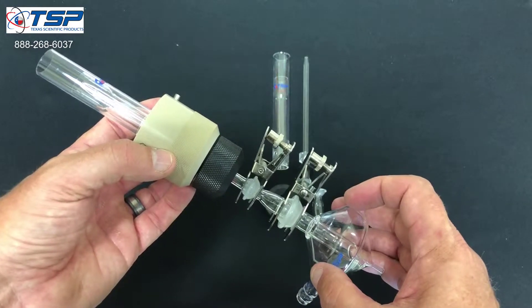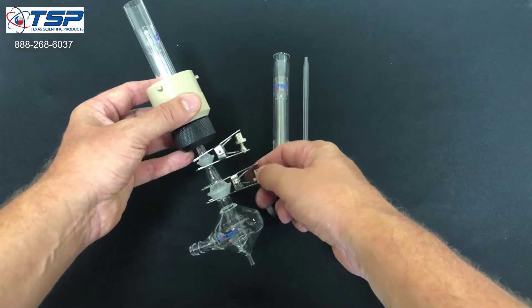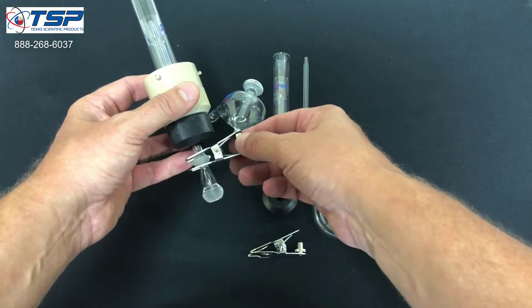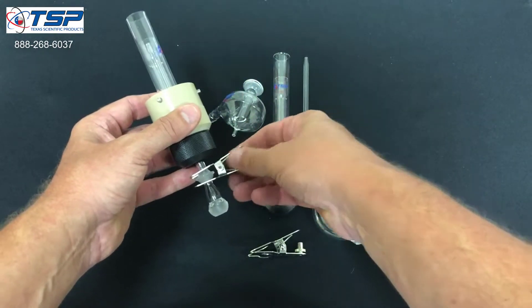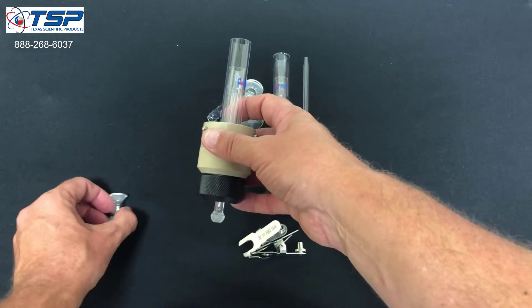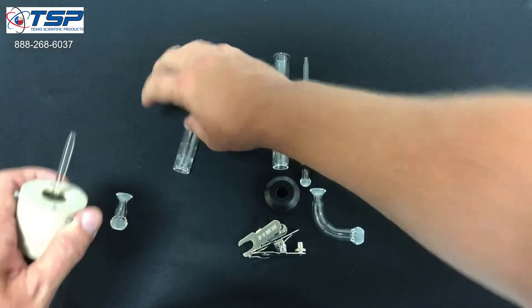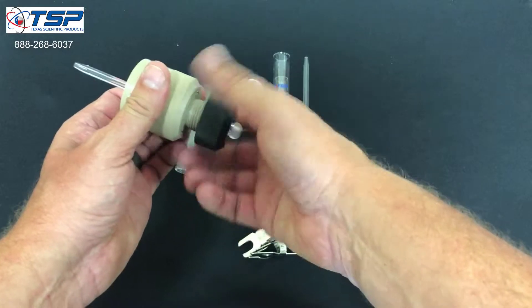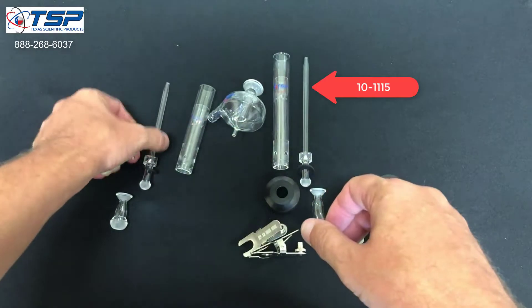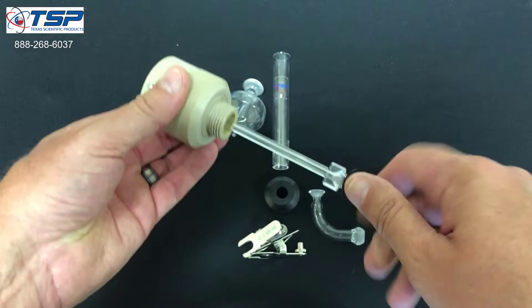Now we're going to do the same thing but for the axial side. We'll go ahead and disassemble this. We'll put the spray chamber aside, take off the adapter, pop out the torch, unscrew the nut, and take the injector out. We're going to swap out for the new injector — this is the axial one.